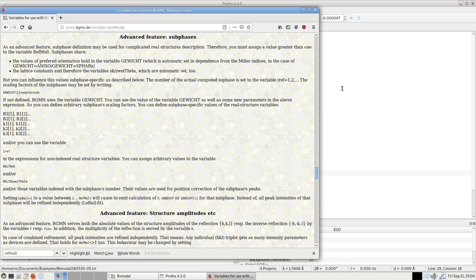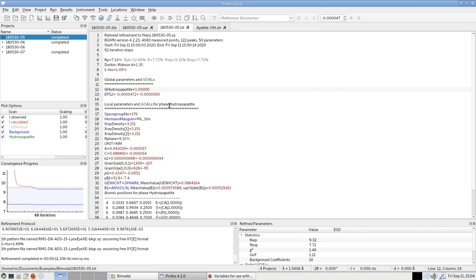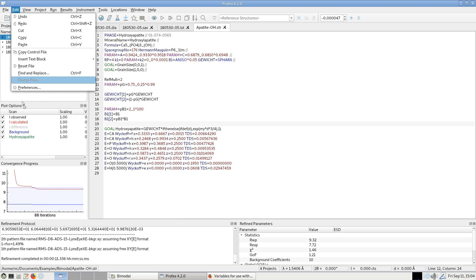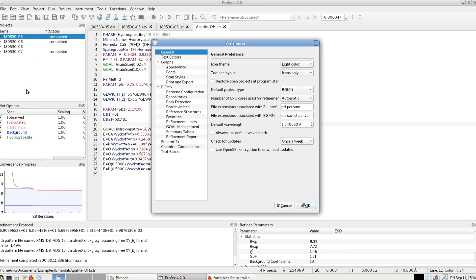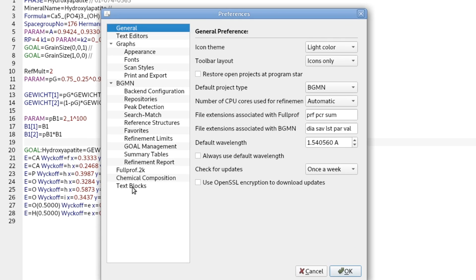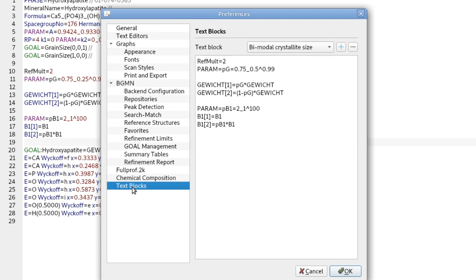And as far as text blocks is concerned, we can create our own text blocks. We go to Edit, Preferences and at the very bottom is the page text blocks and we can create a new one.